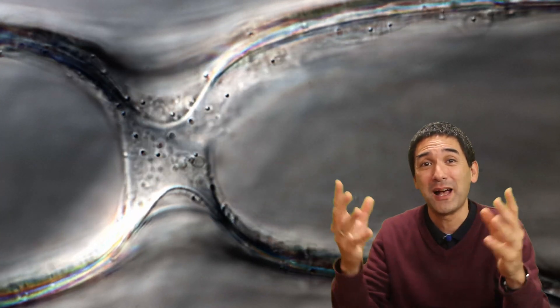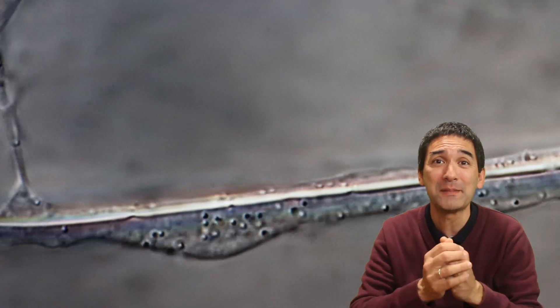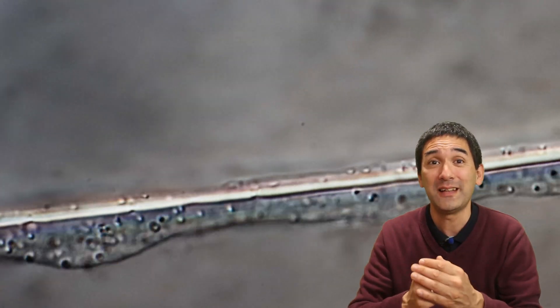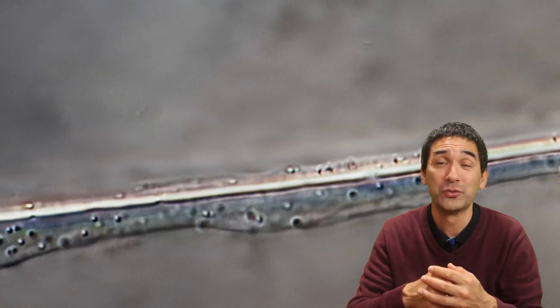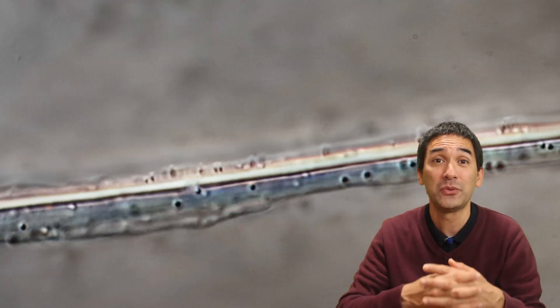I personally like a lot the fact that such a simple specimen like an onion actually has so many things to reveal. If you want to try this yourself, then do make sure that you take very steady videos or pictures.